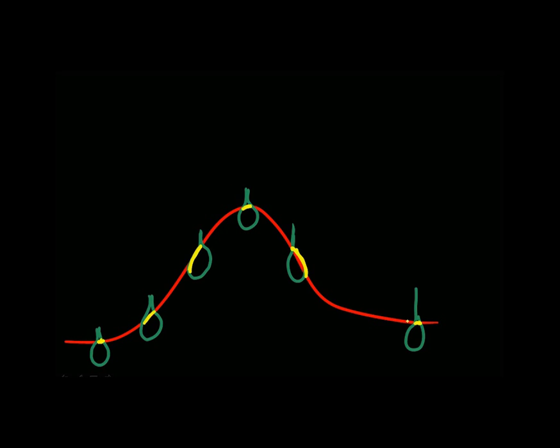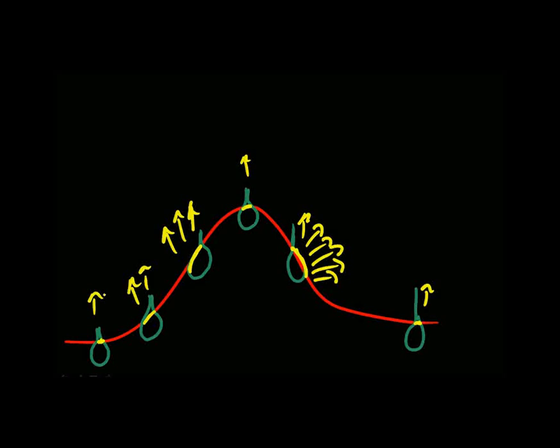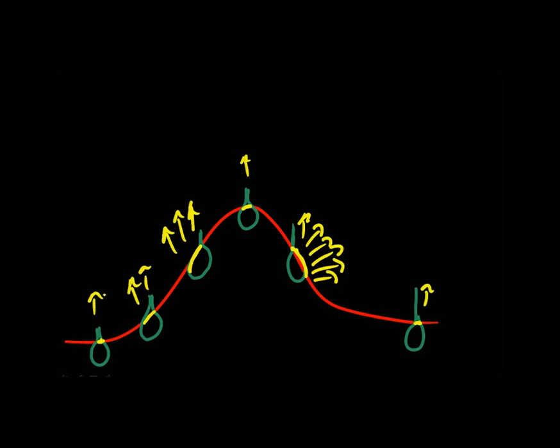So because secondary electrons are only emitted from the absolute surface, a couple nanometers deep, we would see a few electrons emitted from here, many here, just a few here, many here, a couple here, and very small here. So what you see is most of the electrons, these secondary electrons, are being emitted from edges, not flat parts, but edges.